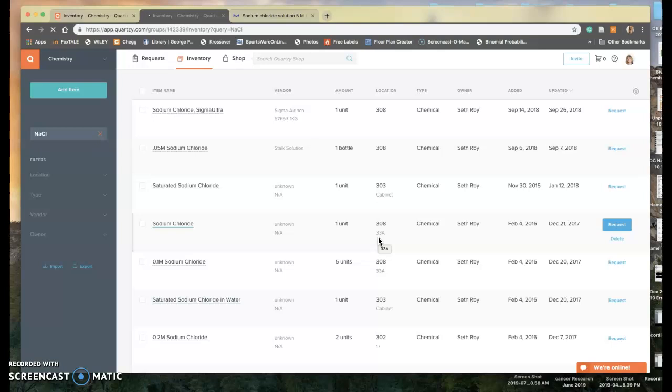As you start working and going through training, you will be able to understand the locations and the location labels a little bit better. If you aren't sure, like say this one said 33A, but this one said 34F, the best thing to do is to go back there and look and check, okay, where does it belong? If they're supposed to be on 33A, but there's no room left, but there's room on 33B, go ahead and put it on 33B and just make sure you make that note as you're doing the inventory.